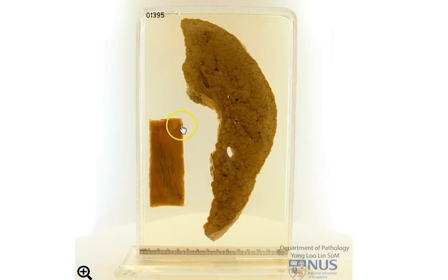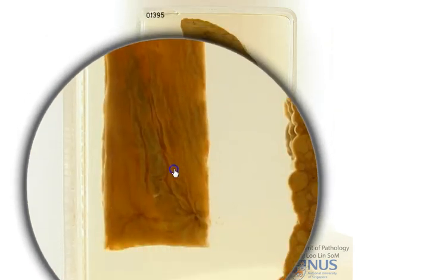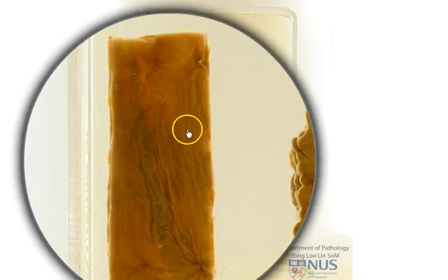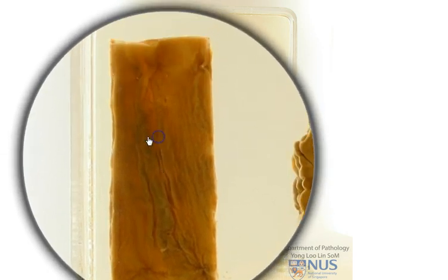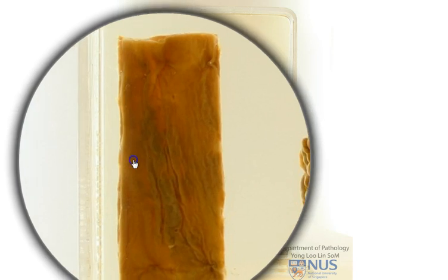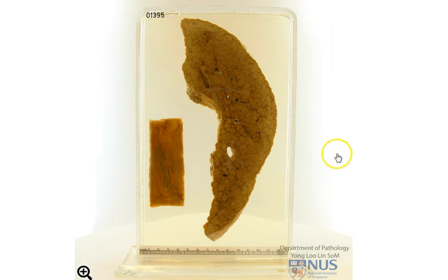Now let's look at the organ adjacent to the liver. We can see that it appears to be a tubular organ that has been opened up. If you haven't already guessed, this is the esophagus — a segment of the esophagus. We're looking at the mucosal surface, and we're trying to show this darkish area which represents a dilated, congested vein. This is actually an example of esophageal varices, which is a complication of cirrhosis due to portal hypertension.